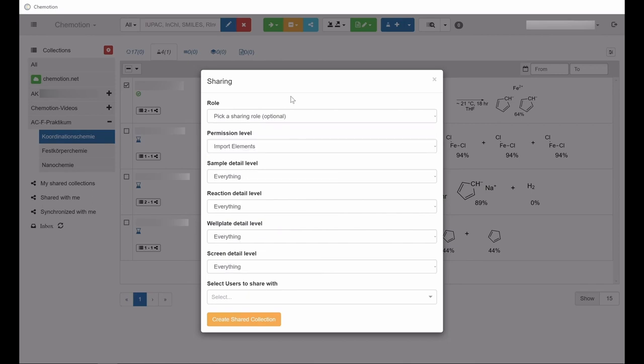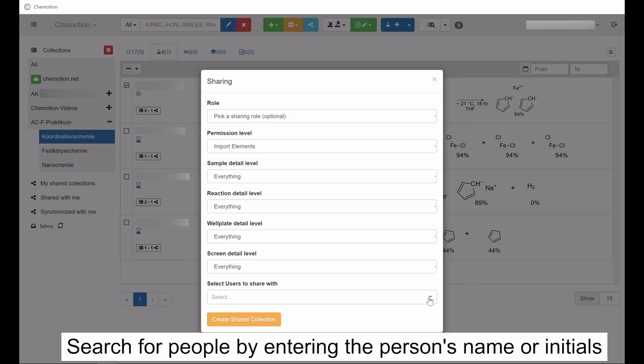Finally, enter the individuals or groups with whom to share the content. Search for relevant people either by entering the person's name or the person's initials used in commotion.